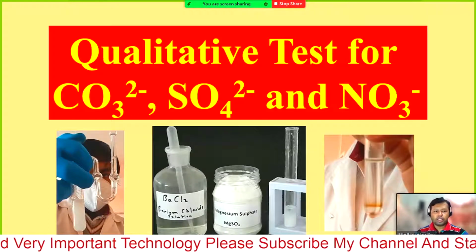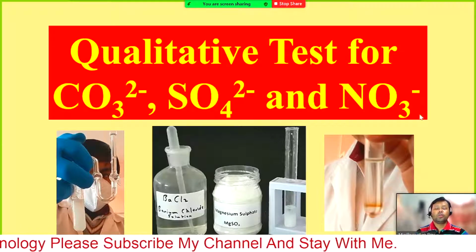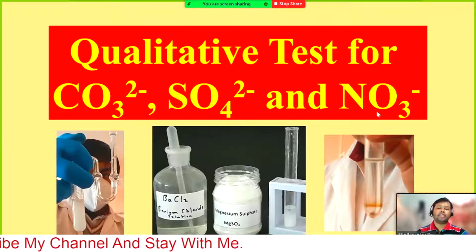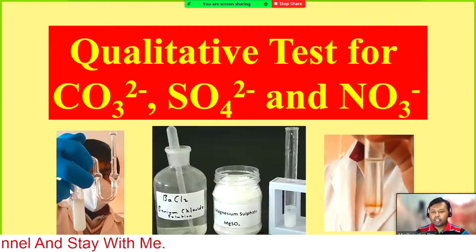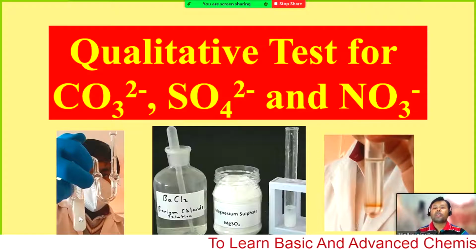Here you can see the observations, what we will observe from the confirmatory tests of carbonate, sulfate and nitrate. If we do a test, we put in some salt and get some gas or effervescence.